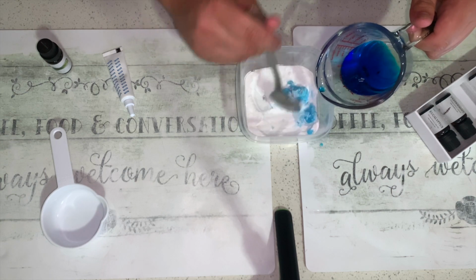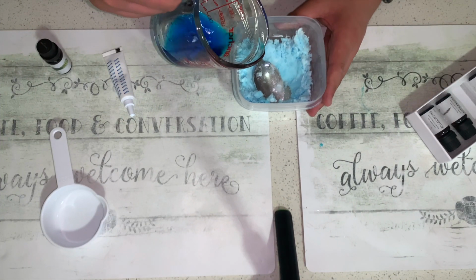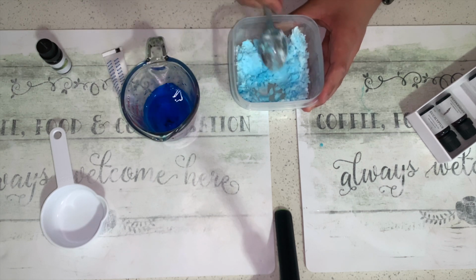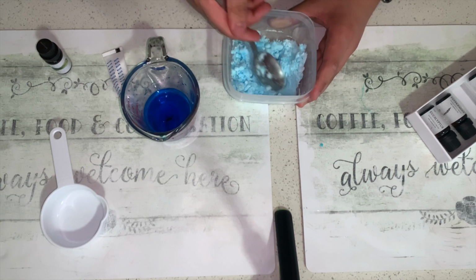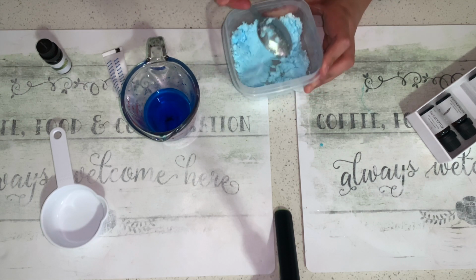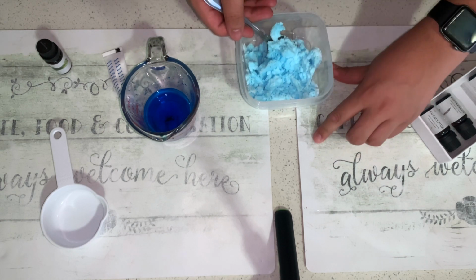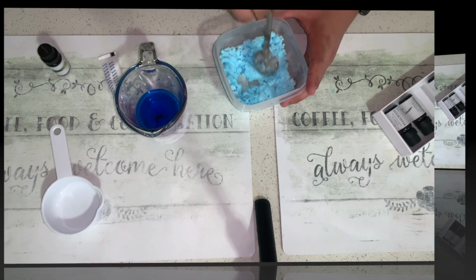And right there, it started forming a paste. Once I had it at the consistency I wanted, I added a few drops of water at a time, that way it didn't become too liquidy. Right there you can see it has a form that is more manageable. I also started cleaning the desk a little bit.